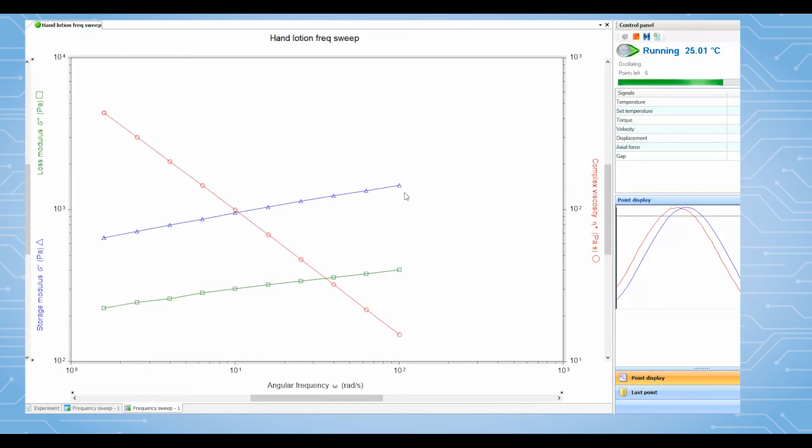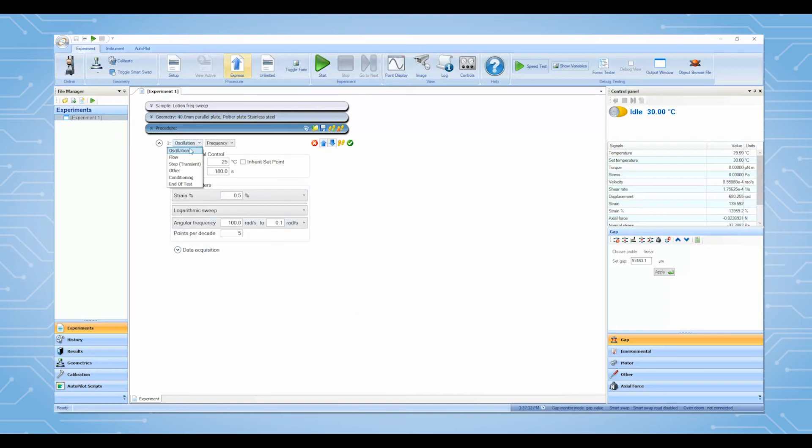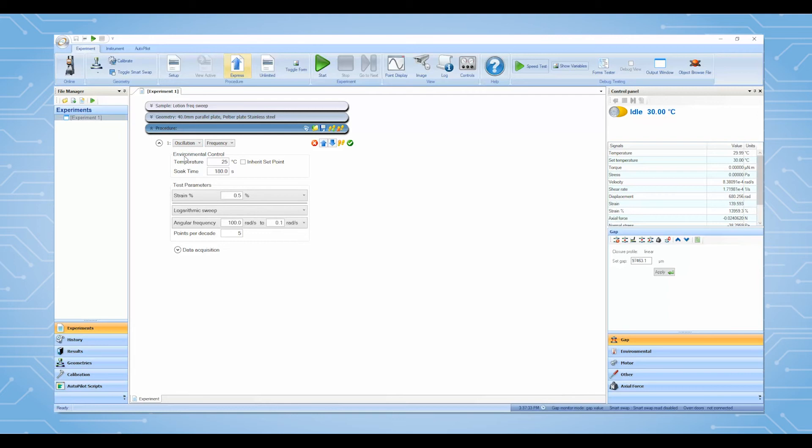The second example will measure the viscosity of lotion under different shear rates using a flow sweep test. From the procedure bar, select flow and sweep.